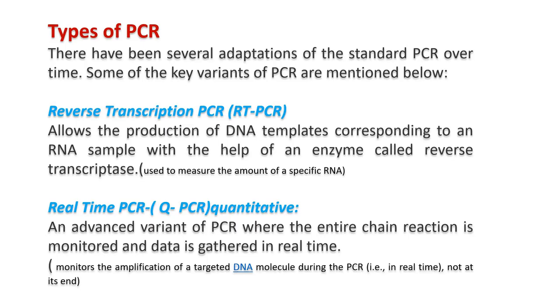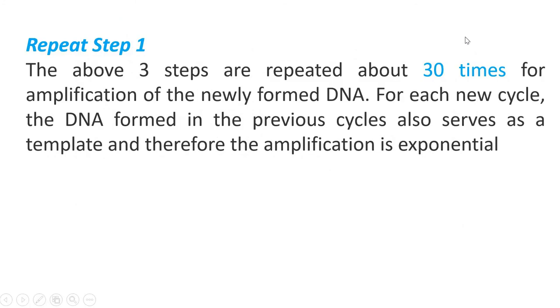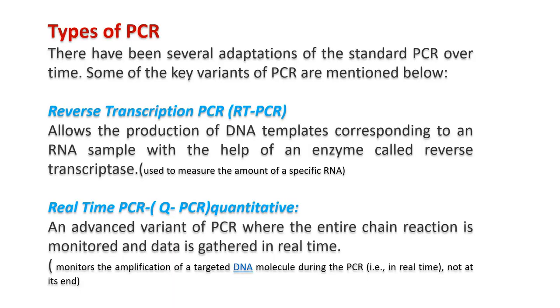Now the types of PCR. With the last slide, we have finished the PCR technique, meaning its steps. Now we will have some types of PCR.